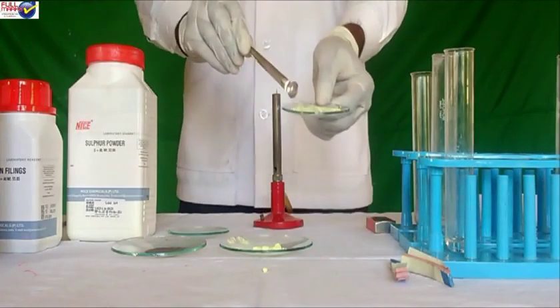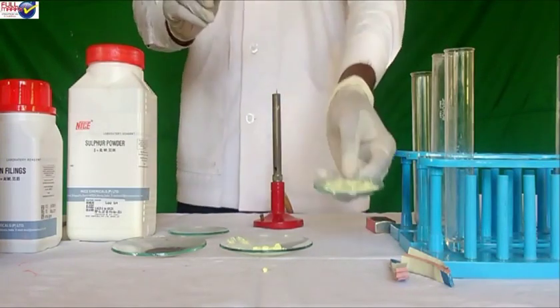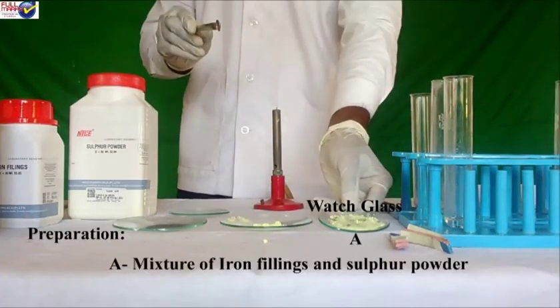Procedure: preparation of a mixture of iron and sulfur powder. Take a pinch of iron filings and 2 pinches of sulfur powder, mix them thoroughly. The product obtained is a mixture of iron and sulfur. Keep it in a watch glass A.